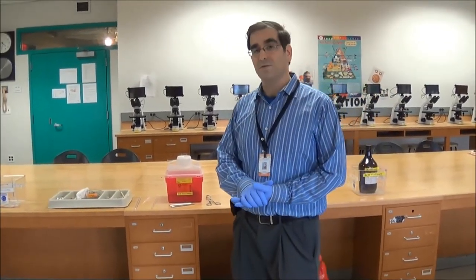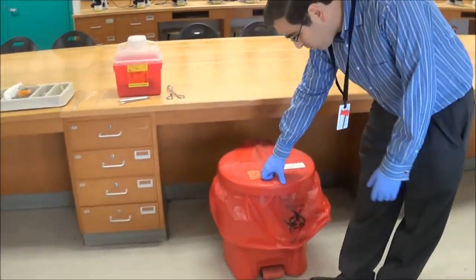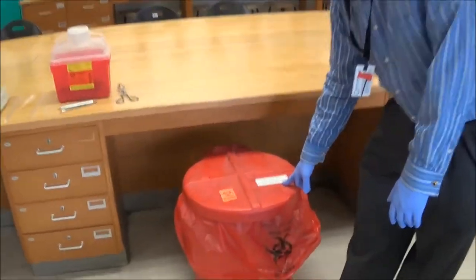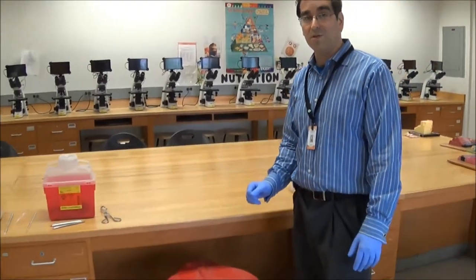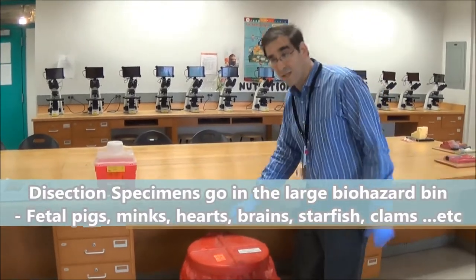There are two types of biohazard containers in the laboratory. One is a large pail labeled 'biohazard solid waste' on the top. This doesn't mean it has to be dry, but it does mean that you don't pour liquids into it. So if you've got something that's wet but still solid, that can go in here.